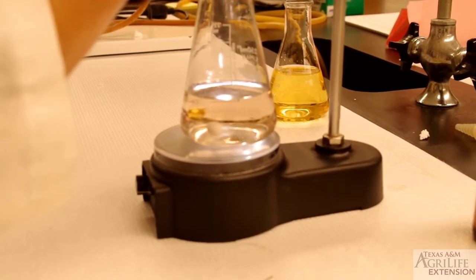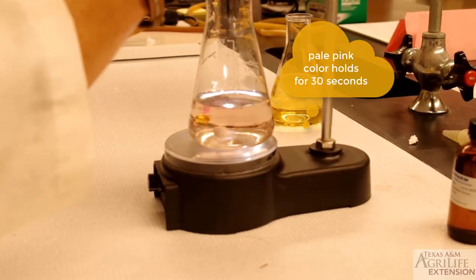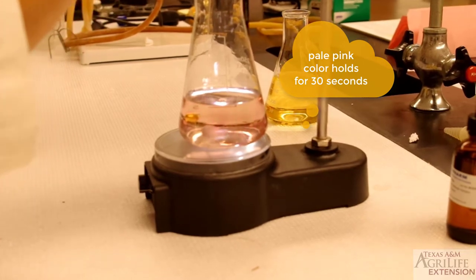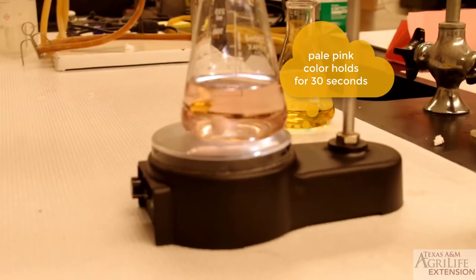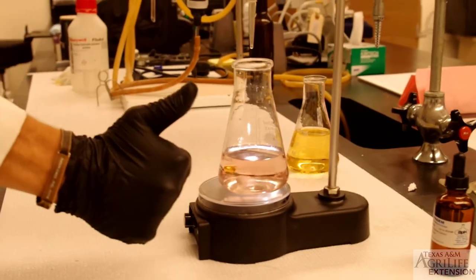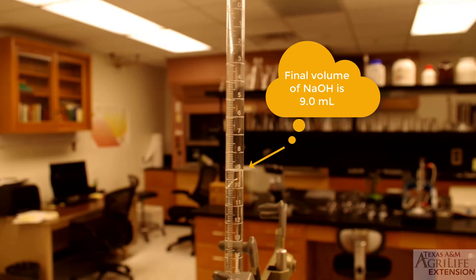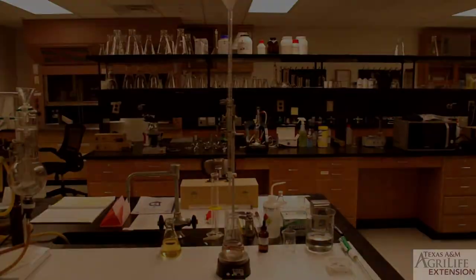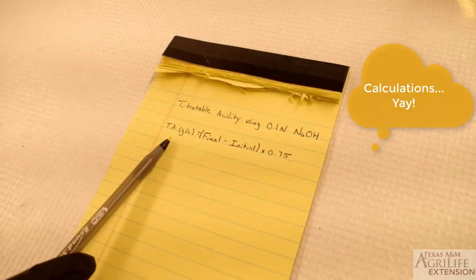Continue titrating your sample until the solution in the flask reaches a pale pink color that doesn't fade for about 30 seconds. Make a note of the final volume of sodium hydroxide in your burette, in our case 9 milliliters. You have now finished titrating your sample and it is time for calculations.